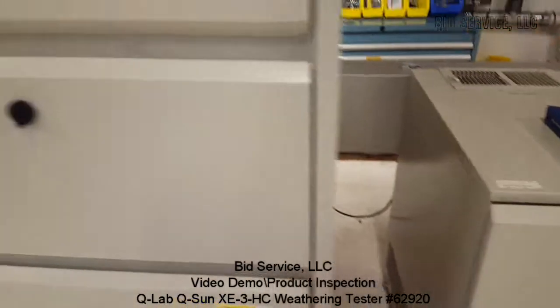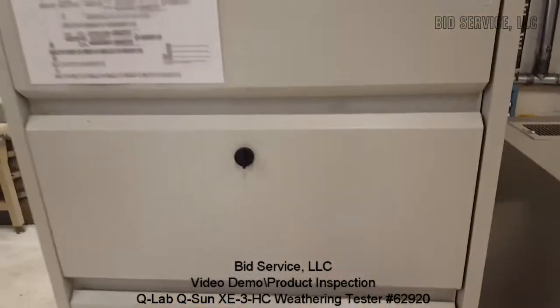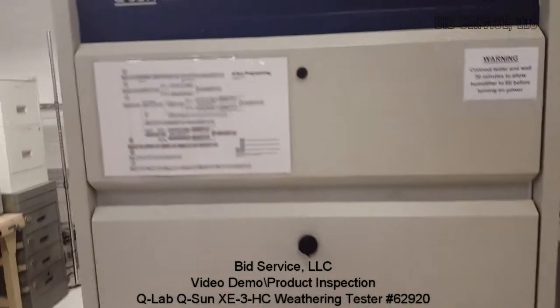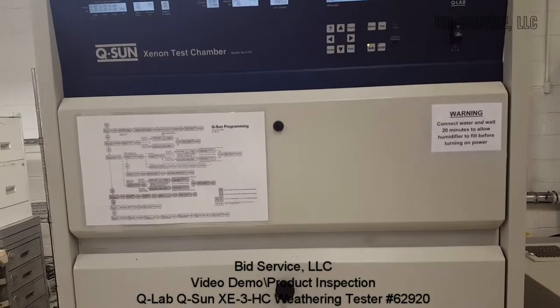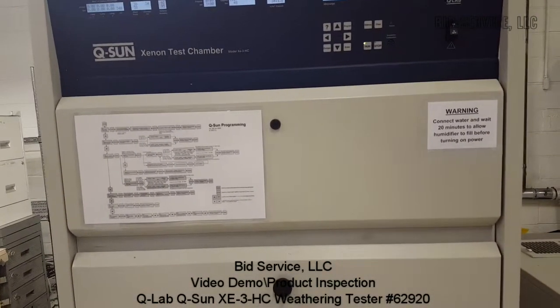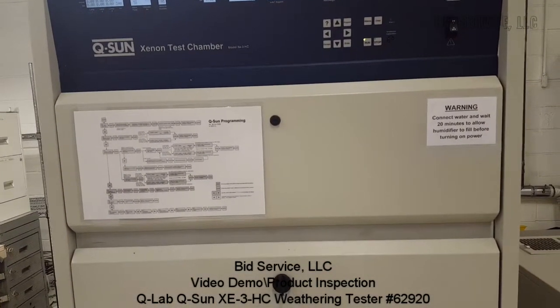Very efficient system for weathering testing. And this completes this demonstration.